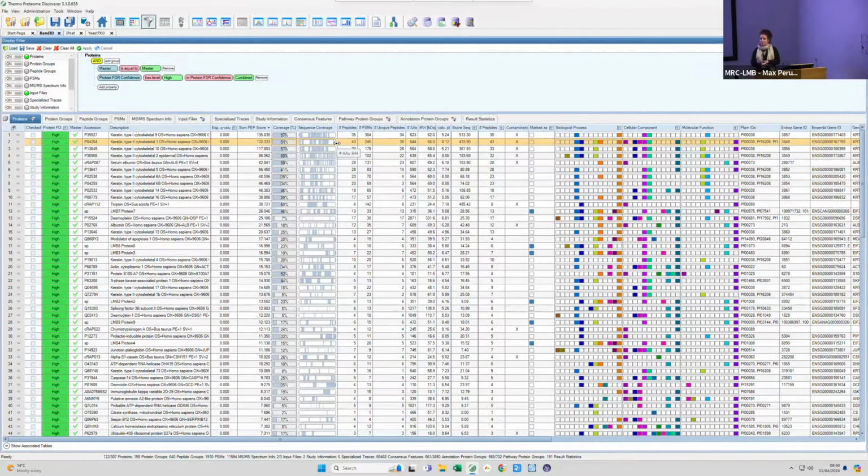You have also several TXT files. The TXT files are completely unfiltered. This can be useful if, for instance, you have your R pipelines. So you can just use these TXT files and process your data with your own pipelines. There's many blogs available that teach you how to do this. In the future, we'll have support for this, so we'll help you with this as well.